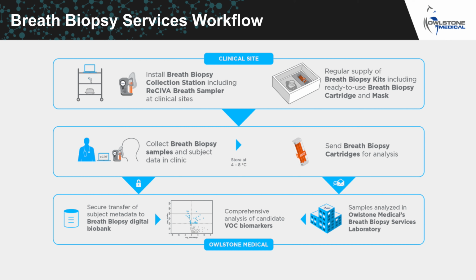Once we receive the samples, we run a series of checks on these for any errors during sample collection before they are analyzed using our standardized analytical methods using TD-GC-MS. And then this is followed by comprehensive analysis by feature extraction and statistical analysis combining with the study metadata. This data is then interpreted by our clinical sciences team before compiling a report at the end of the study.